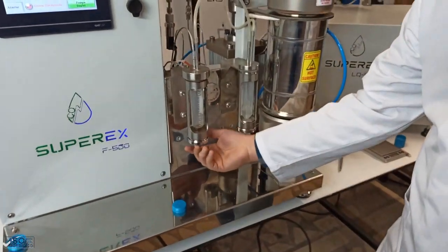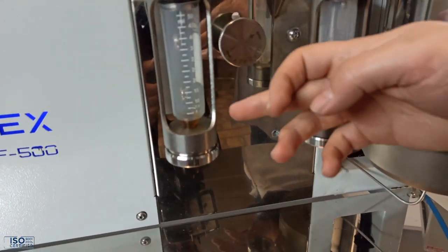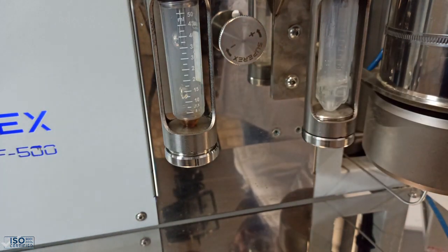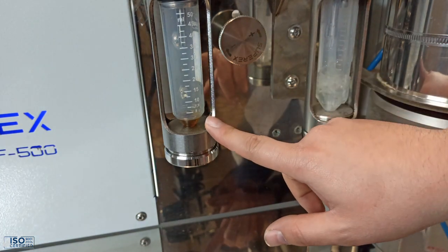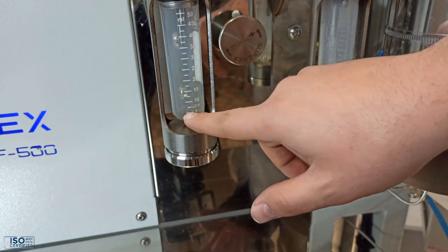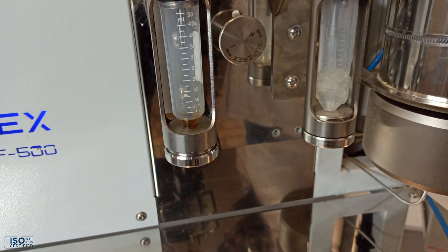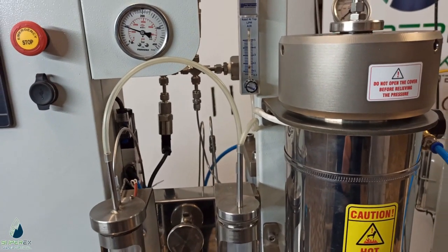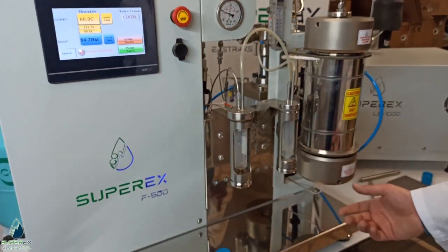We have taken this amount of extract. When we compare to supercritical CO2 extraction, this yield is less than with CO2. It should be five or six milliliters with CO2, but with R134a the yield is lower. However, the composition of the extract may be different from supercritical CO2 extraction.